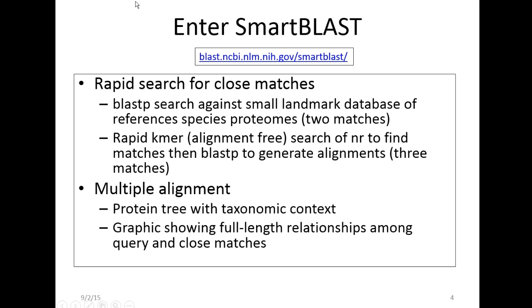The search against NR uses a different, rapid KMR algorithm — an alignment-free approach — that lets you search NR very quickly and generates hits to the most similar sequences. Then, to make the alignments, we use BLASTP or BLAST2 sequences. It also incorporates, with the five matches you get back, a multiple alignment that incorporates your query sequence, and from that we generate the SmartBLAST graphical display.